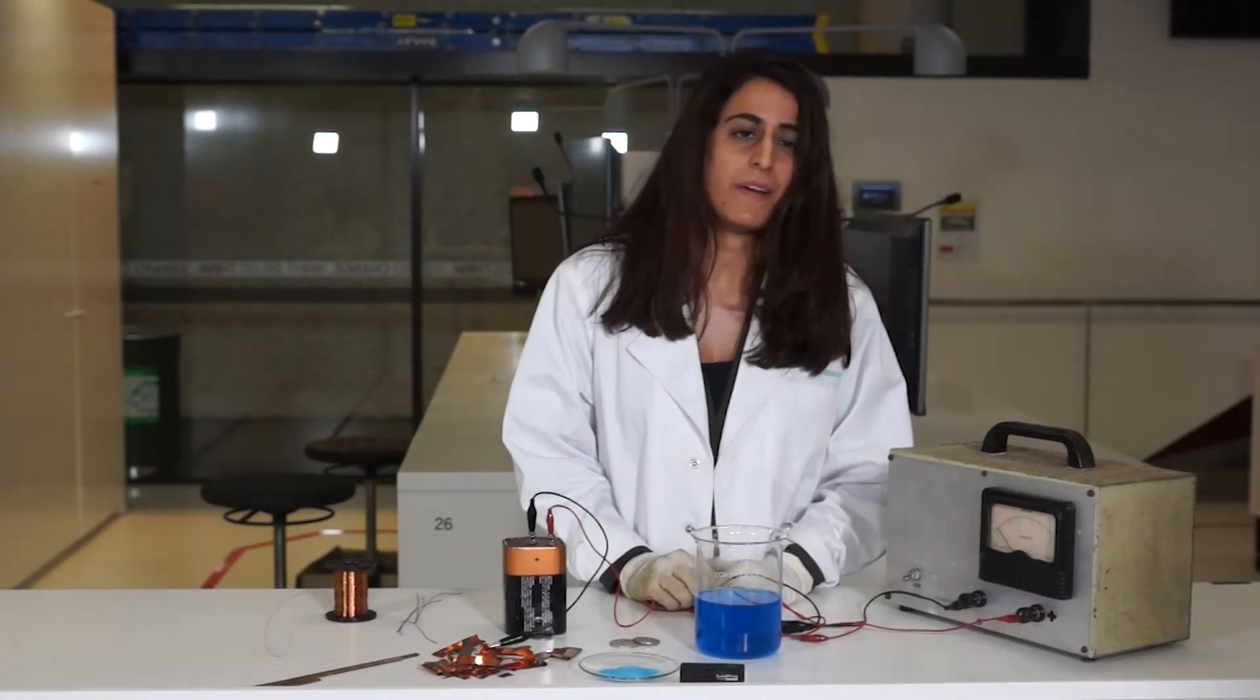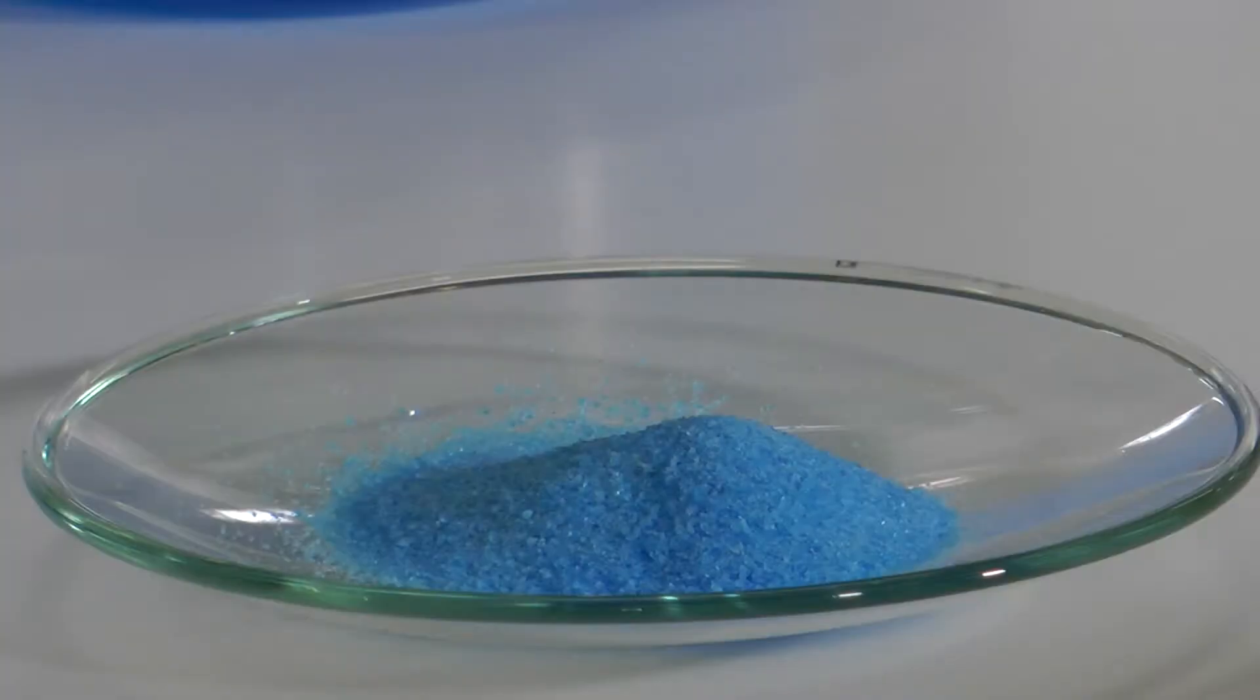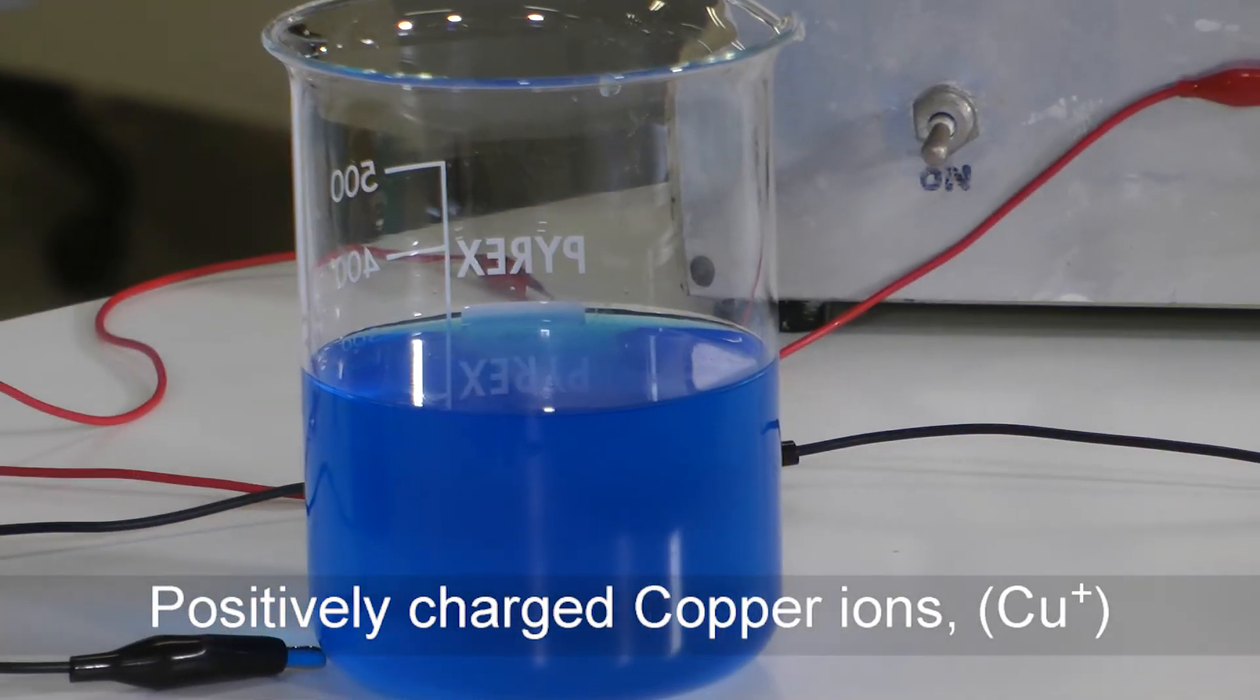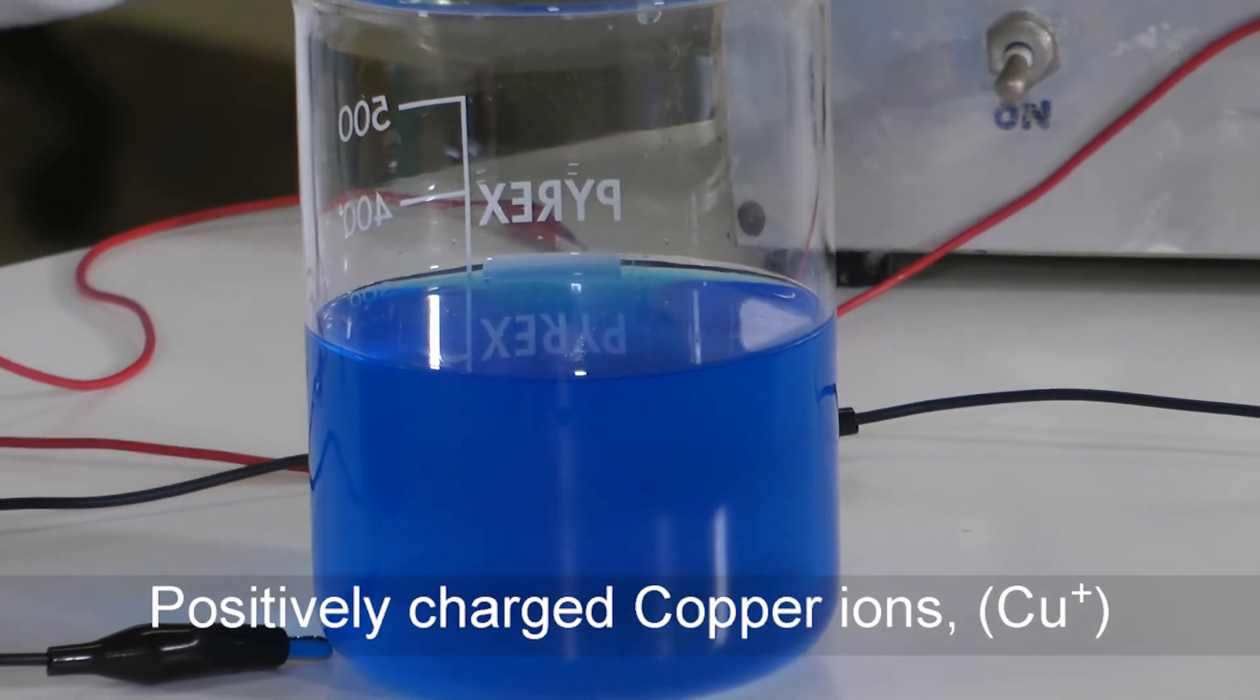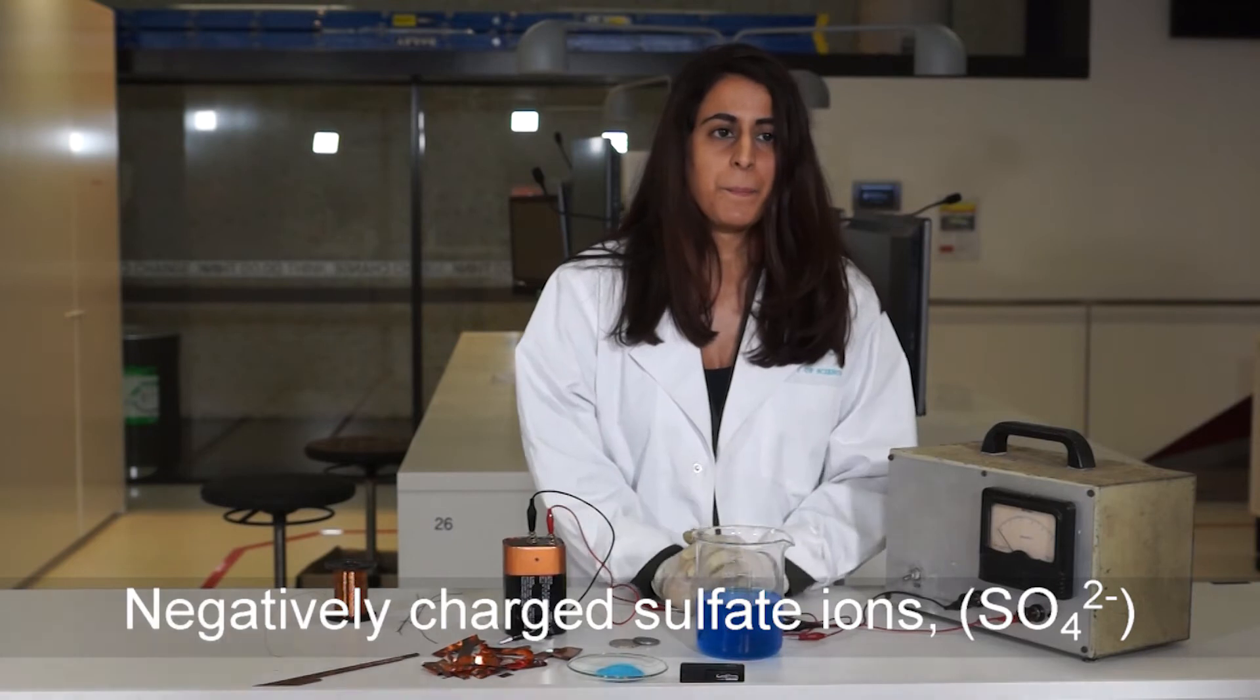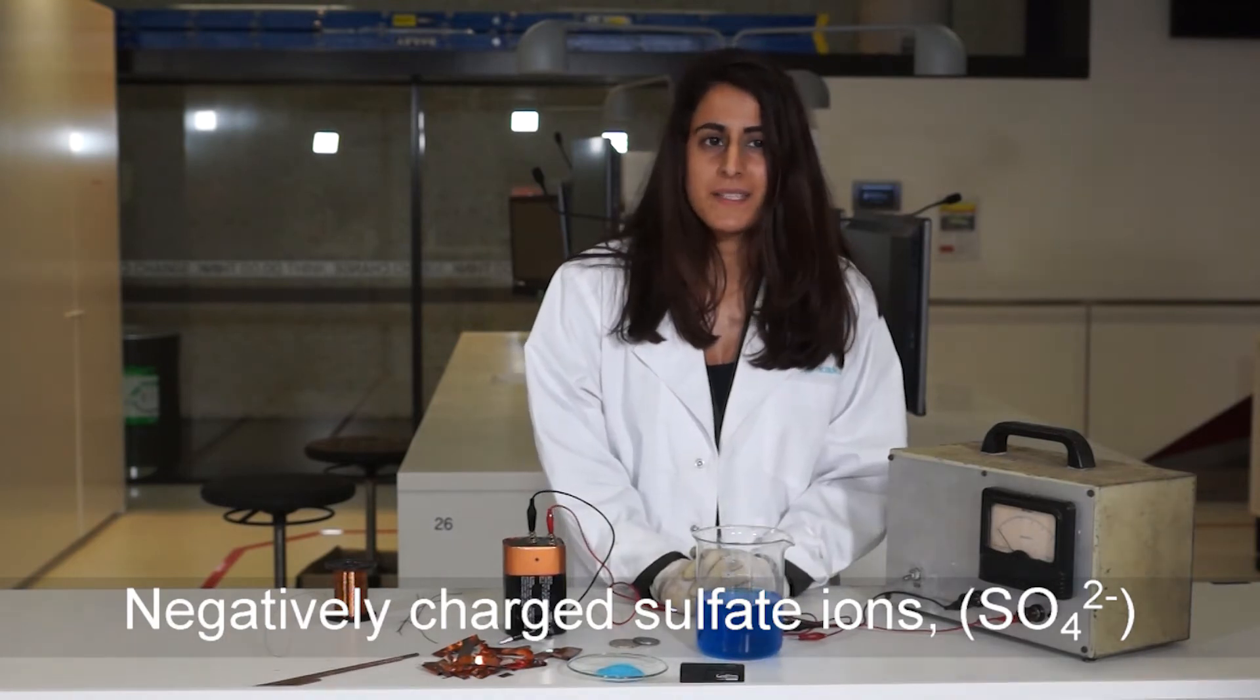And then we need some copper sulfate. You can just get this at hardware stores. And when we dissolve in water, we get positively charged copper ions and negatively charged sulfate ions. We call this the electrolyte.